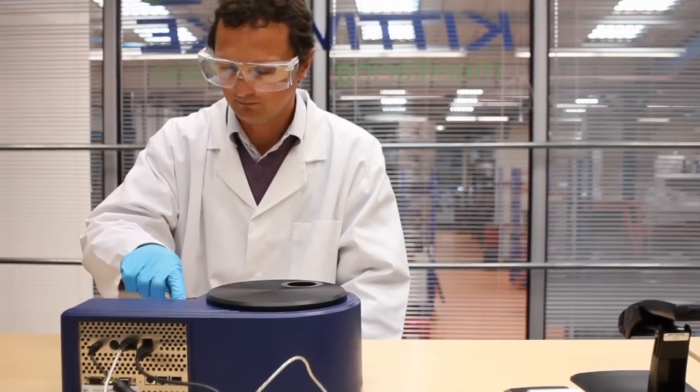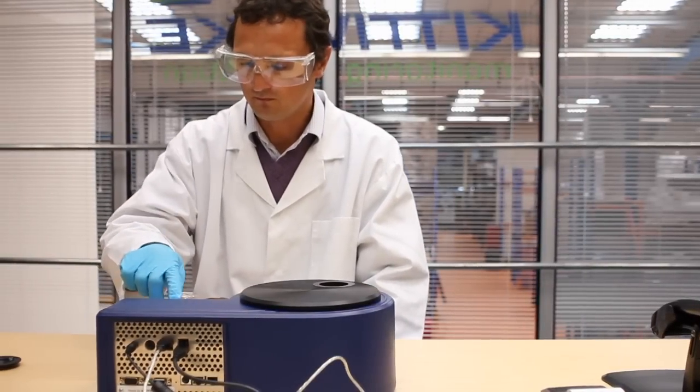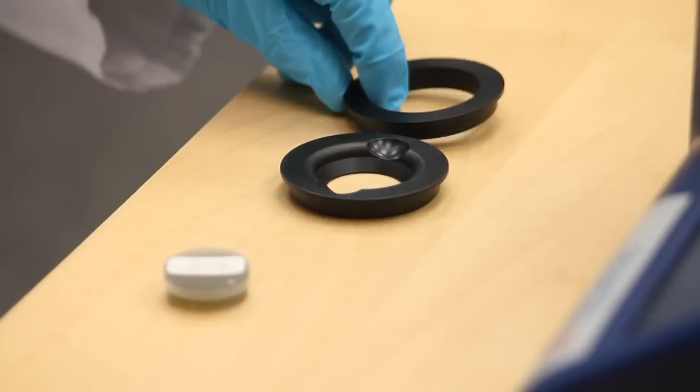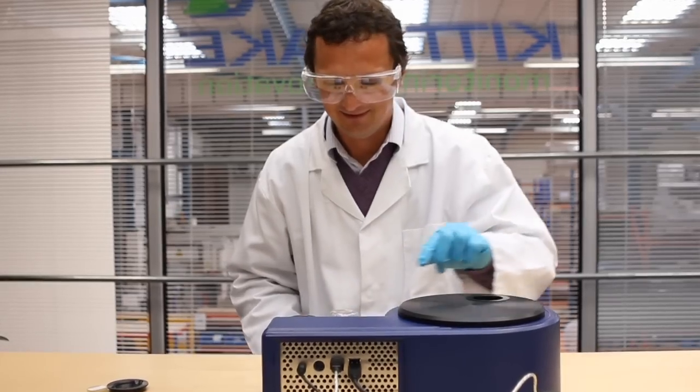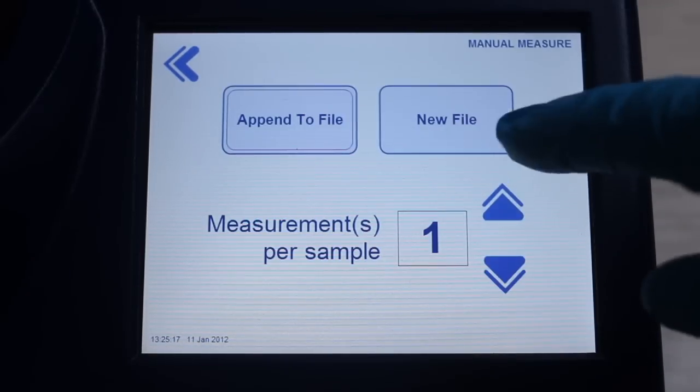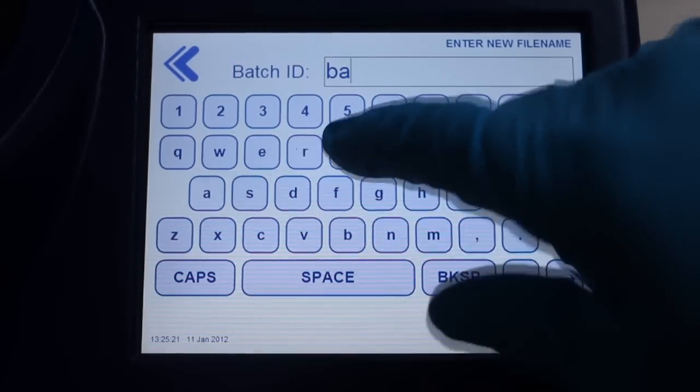The Particle Quantifier is an industry standard test method for measuring wear metal ion contamination. Kittiwake's new PQL provides a quick, simple to use touchscreen interface, ensuring that the taking of measurements is a simple process.